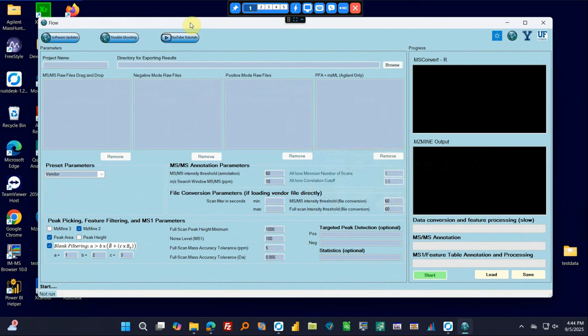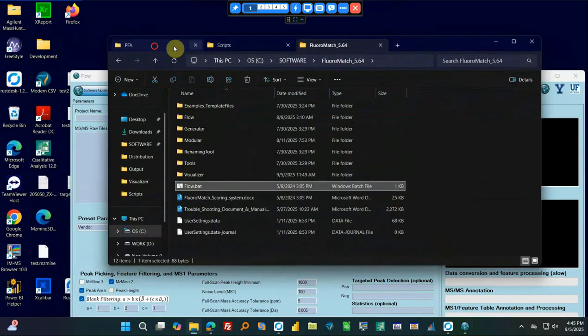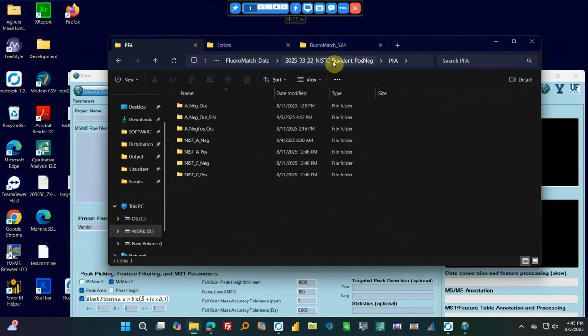And then you'll also need mzMLs directly from Agilent Qual Browser that you can export as well. This is for the MS1 data only. You only need a few reference files, I'd say at maximum 10. These are just going to be used to visualize your EICs as you click through the visualizer, as well as to visualize the entire MS1 spectrum, not deconvoluted. You'll get a deconvoluted MS1 spectrum from the Agilent file itself. So, with all that being said, let's go into some example data.